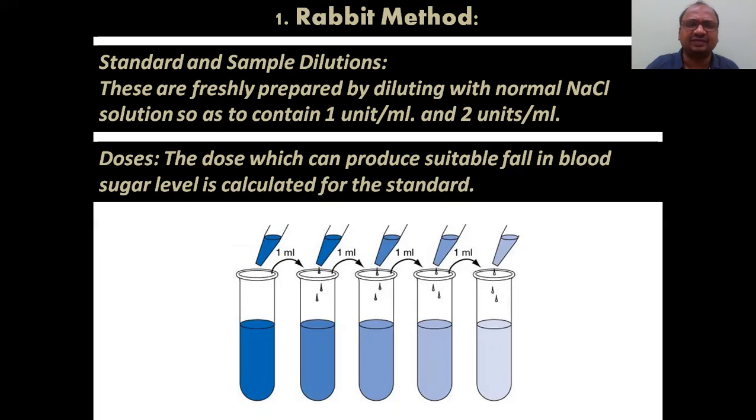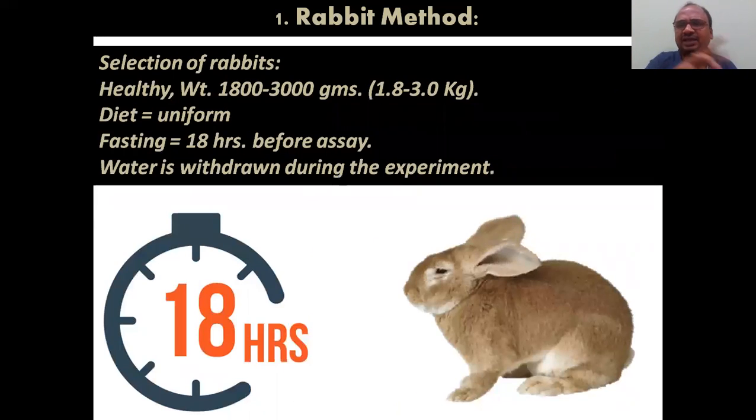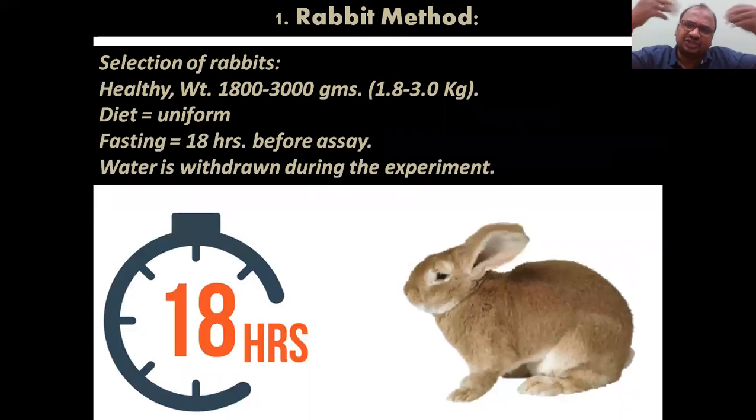Like this, in a series like a burette, 1 ml, 1 ml, like that you can calculate on paper, and according to that you can do it. Now we will see the standard and test solution.